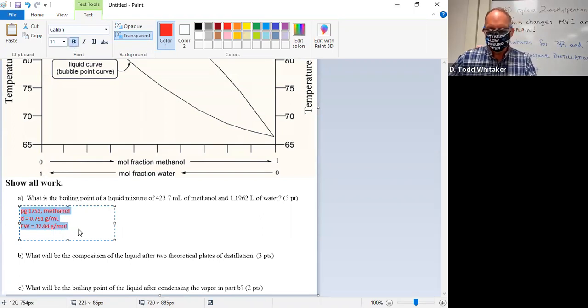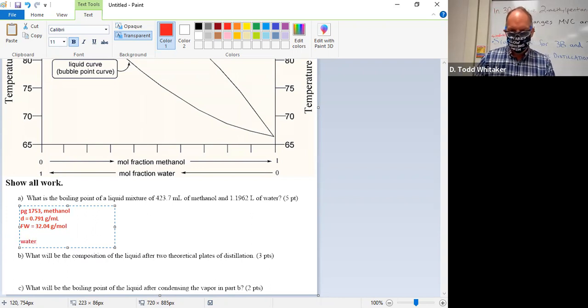Okay, that's our research. We're not going to do research on the water. But we're going to need the density from your memory. We're supposed to know that one. 1.00. That'll suffice. We're using 3 sig figs above, so 3 sig figs should work here. And units are grams per milliliter. Formula weight, you can give me 4 sig figs on that. 18.02. Periodic table, 2 H's, 1 O.